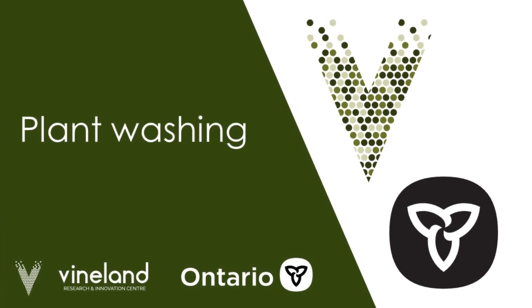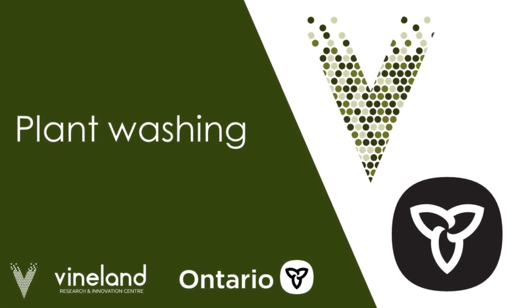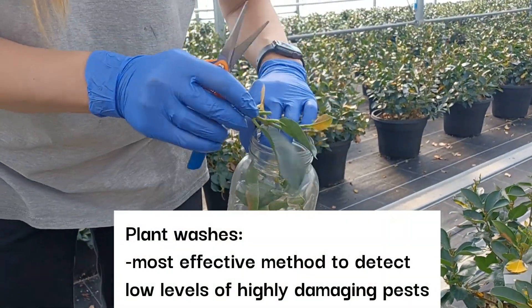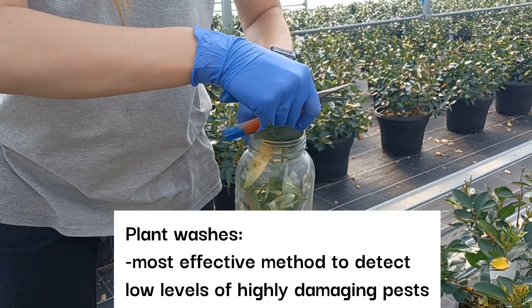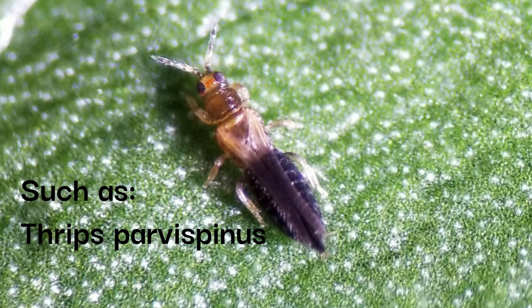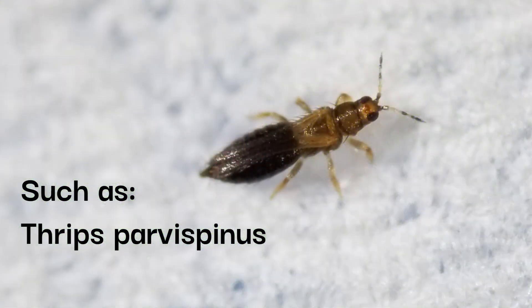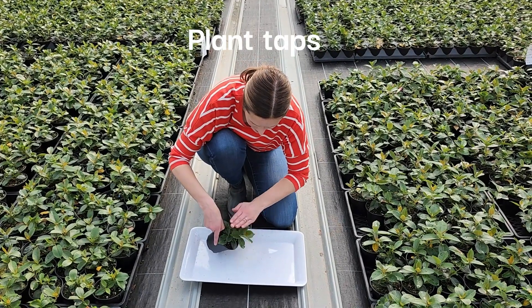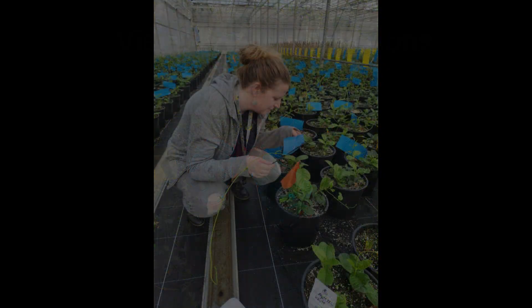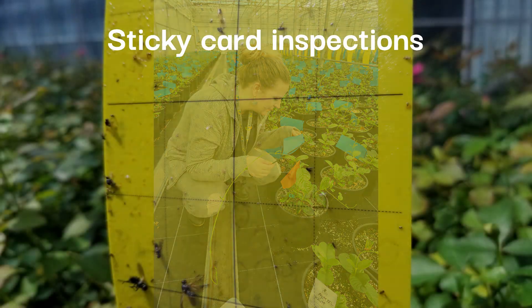In this video we will demonstrate how to conduct plant washes on your farm. Plant washes are the most effective method to detect low levels of highly damaging pests such as thrips parvospinus, a new invasive pest. Other sampling methods such as plant taps, visual plant inspections, and sticky card inspections are less effective.